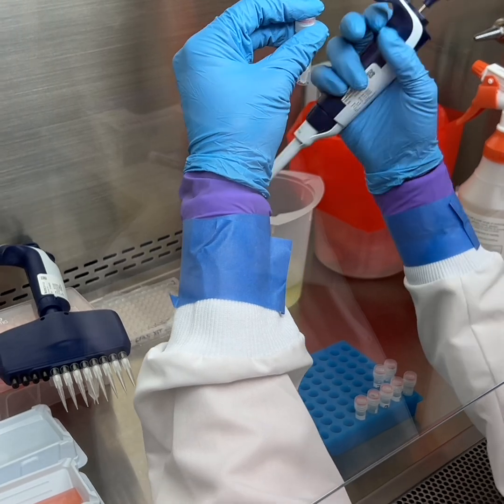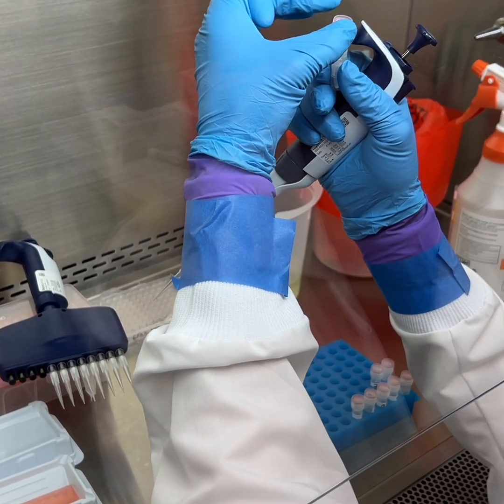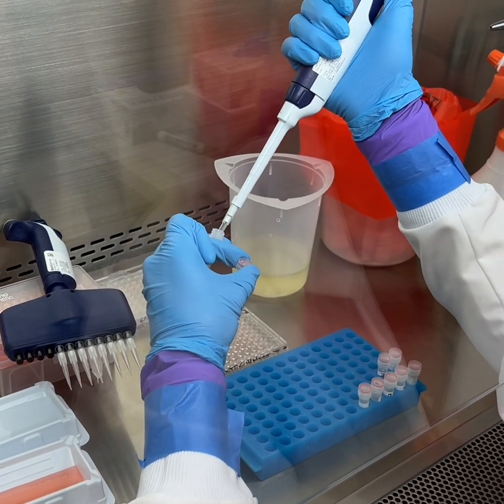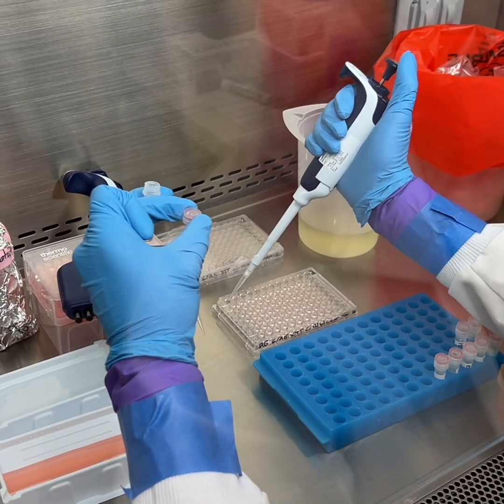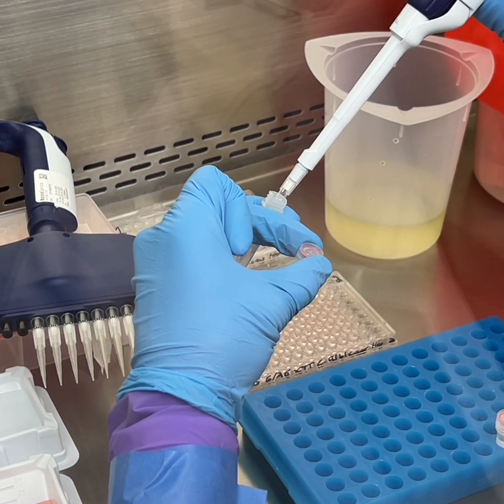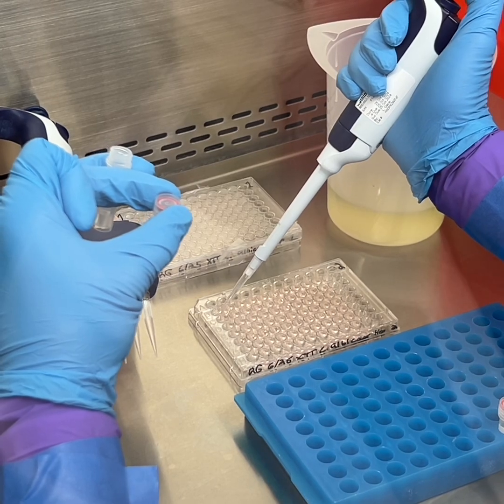And you're going to put 200 into the first column.